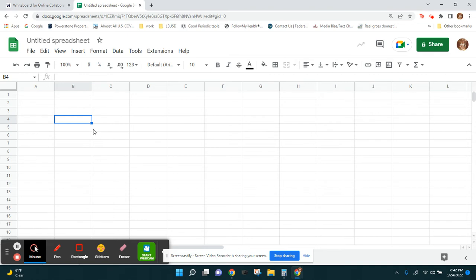So let's say that we had the following data from our diluted known concentration solutions. I'm going to use this data from an old lab. Yours might be different, but there's going to be different concentrations and percent transmittance, or percent T.